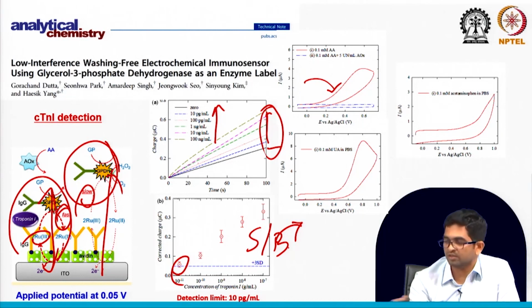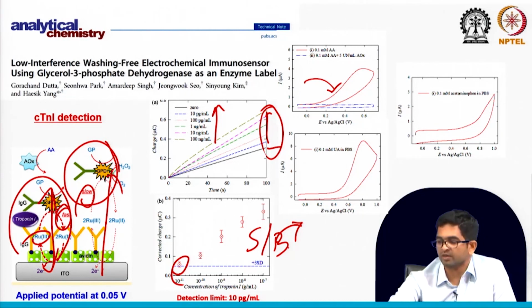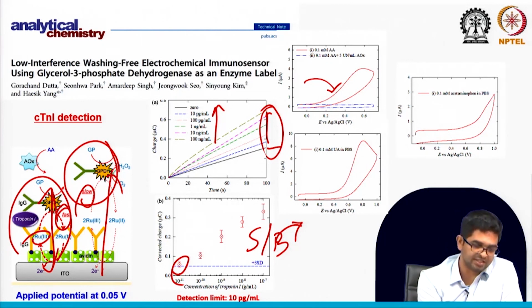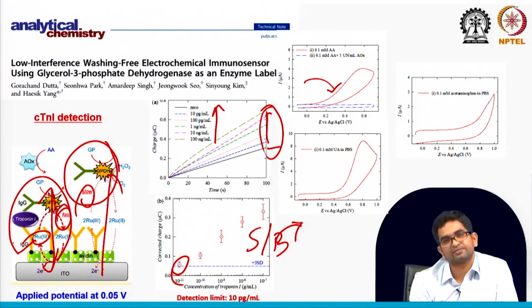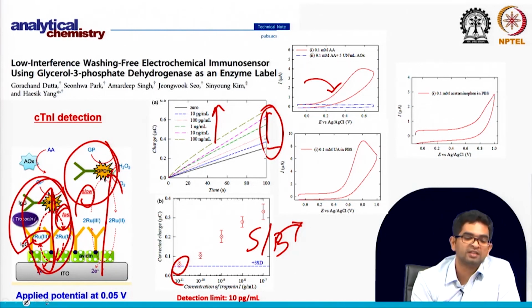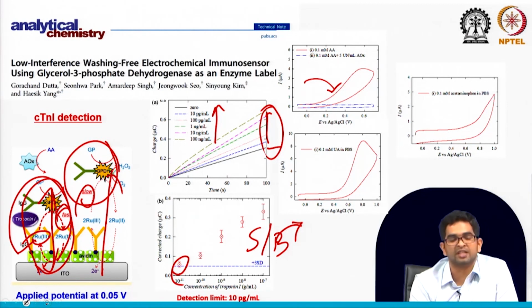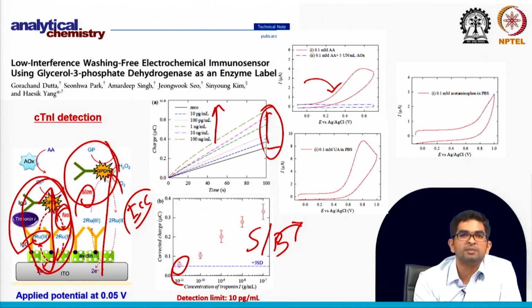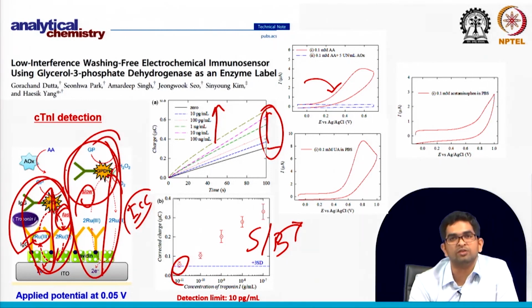There is still lots of scope for development of the wash-free biosensor. You can change the mediator, make the enzymatic redox cycling faster, or try some ECC-based redox cycling, but you have to keep in mind that the background reactions should also be slow at the same time.